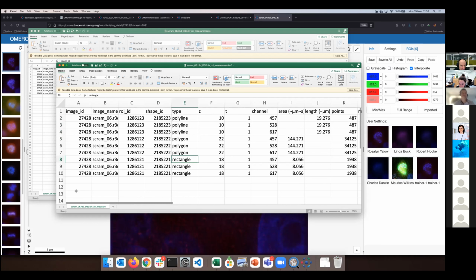These are of course the names of the images, and you can see that the ROI ID is always 3 and 3. So ROI and shape are also actually containers, if you want. Now it's very simple because each ROI contains 1 shape, so you don't have to break your head over it, but you can see that these numbers are altering as well in a logical way, as you would expect.